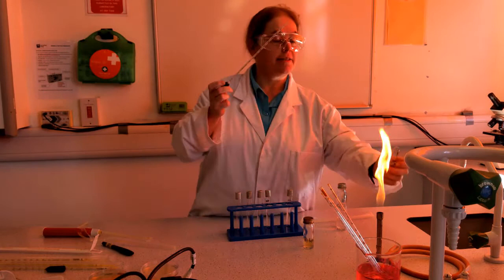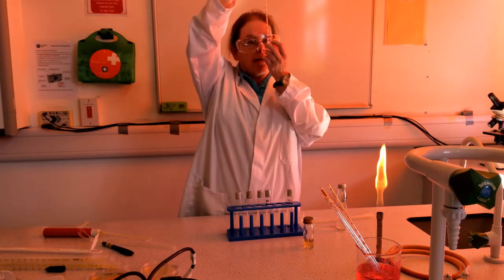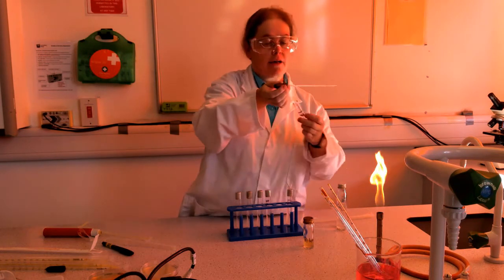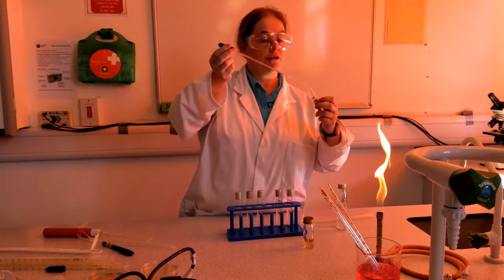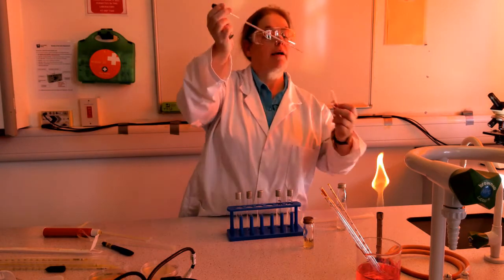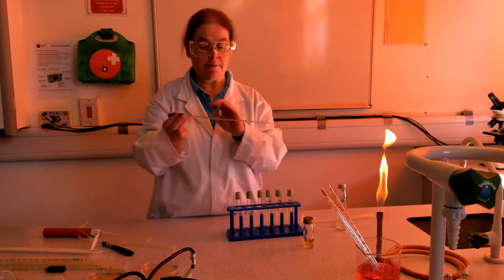Right, so we will take 0.1 mils from the 10,000 dilution and transfer it to another tube. And in this tube we've diluted our original bacterial culture by 1,000,000 times. Great.